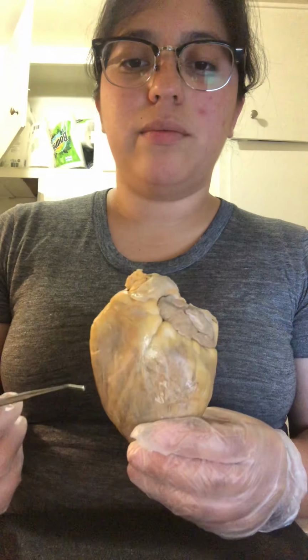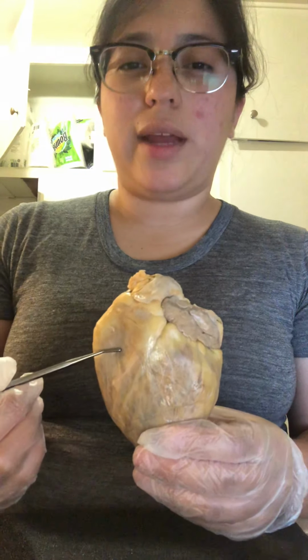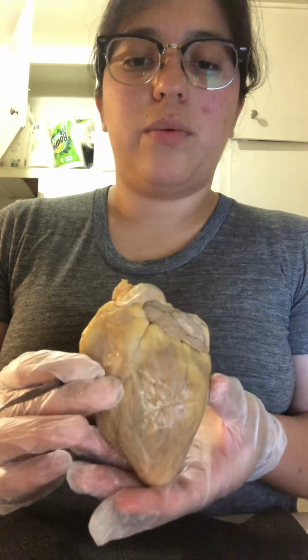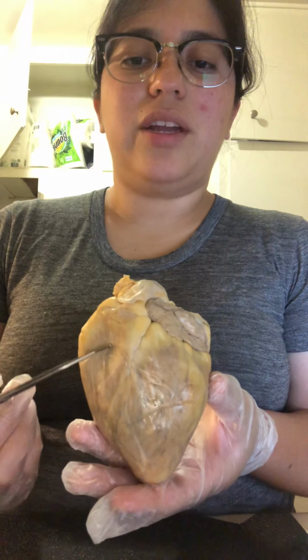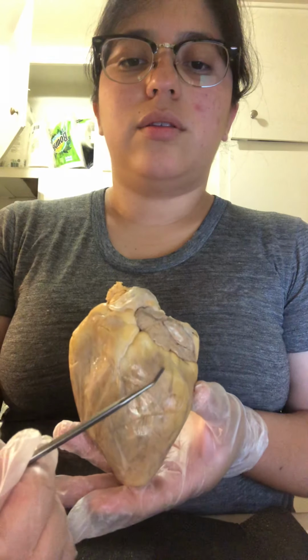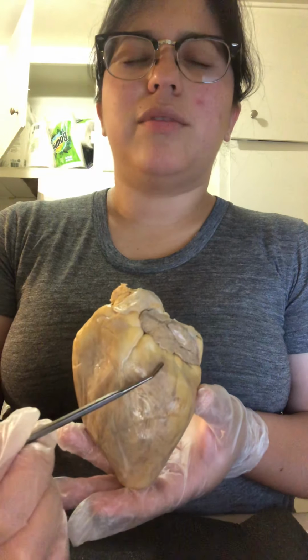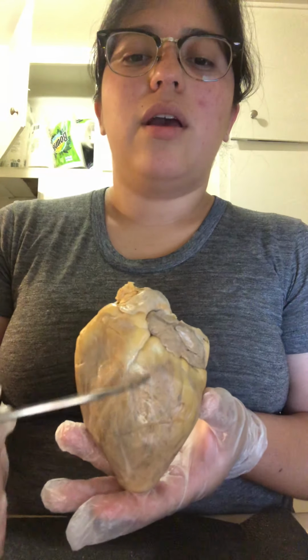So right about here would be the right atrium, right about here. So the right atrium would be around here. The right ventricle would be around here. The left atrium would be just about here. So the right atrium, the right ventricle, the left atrium, and the left ventricle would be about here. And right in the middle would be the interventricular sulcus of the sheep.